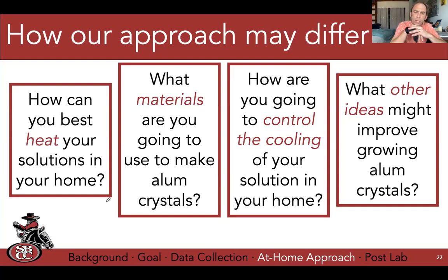Yeah, Sophia, you have a question? Would you reheat those crystals in the microwave? Yeah, I use the microwave a lot just because of how easy it is. The crystals are going to take a little bit longer because they're at a lower energetic state than the powder. So it's going to take a little bit longer, but they will go into solution.